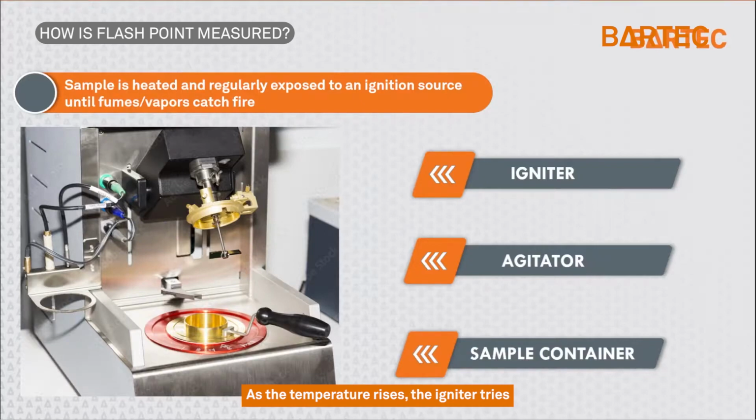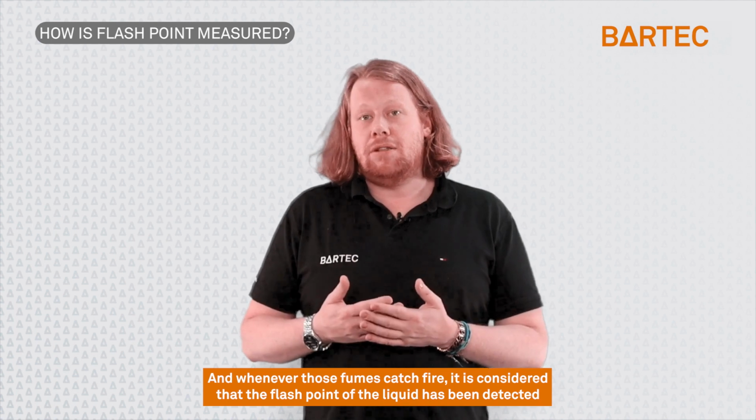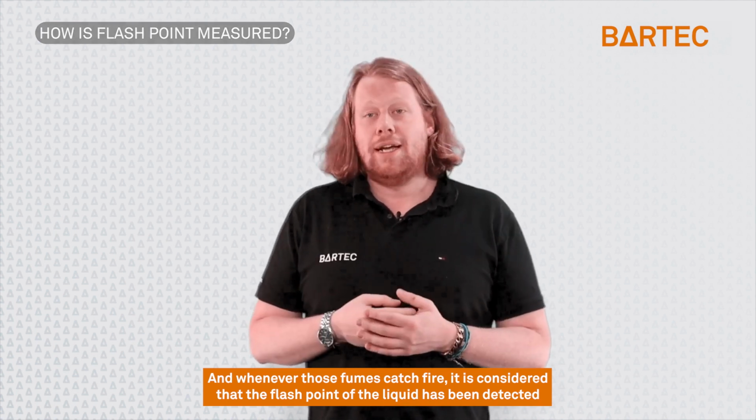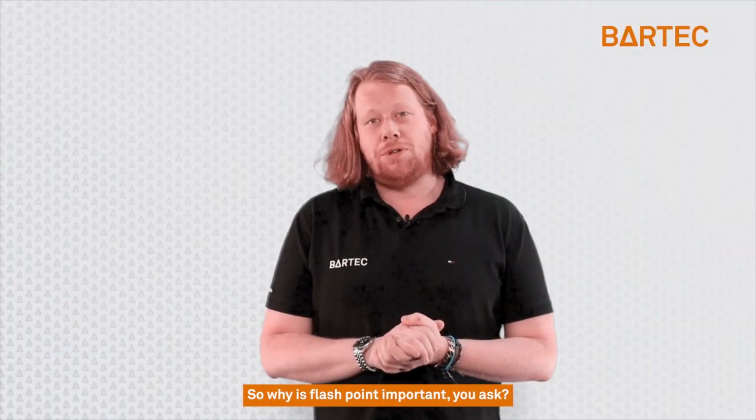As the temperature rises, the igniter tries to ignite the fumes at a certain frequency, and whenever those fumes catch fire, it is considered that the flashpoint of the liquid has been detected, and it is then recorded as the flashpoint.